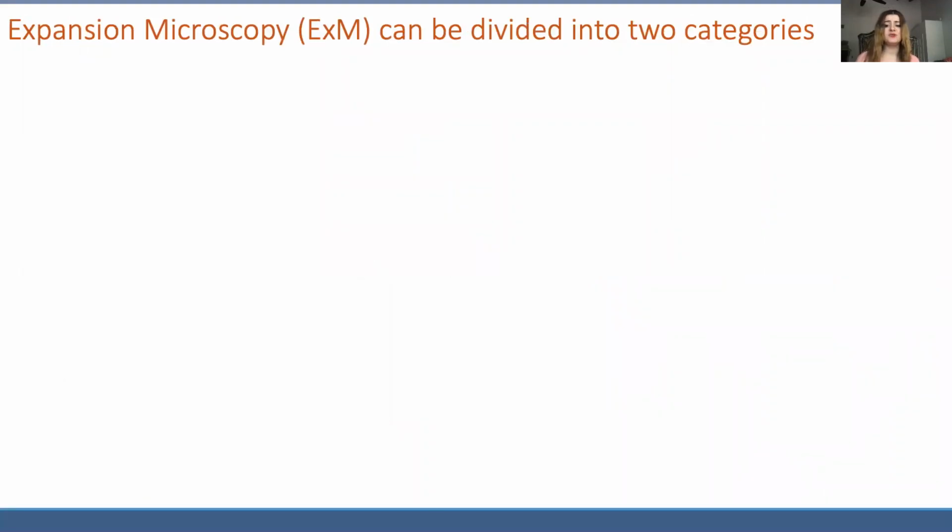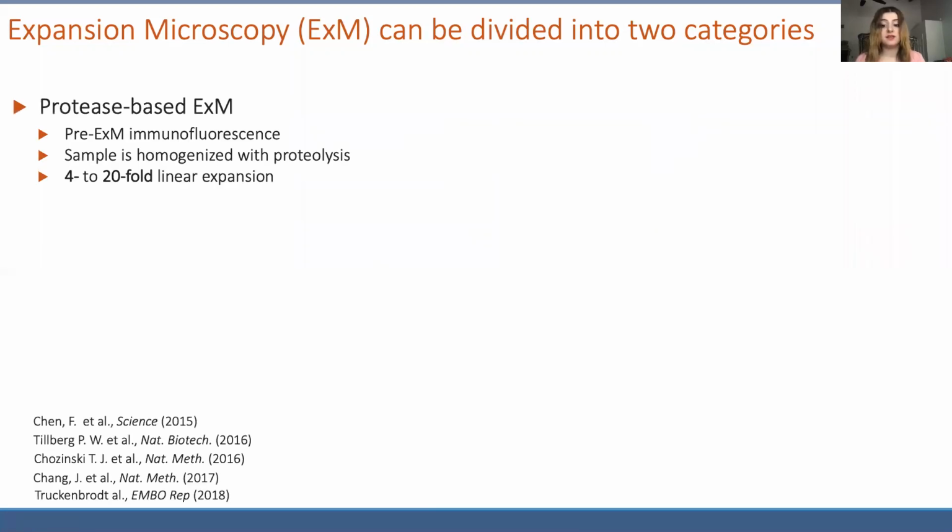And so we set out to achieve this goal, capitalizing on expansion microscopy because of the biomolecule decrowding effect it has. Since its conception in 2015, expansion microscopy has seen further development, particularly by the Boyden, Chung, Vaughan, Rizzoli, and Guichard labs. And we could divide expansion microscopy into 2 categories.